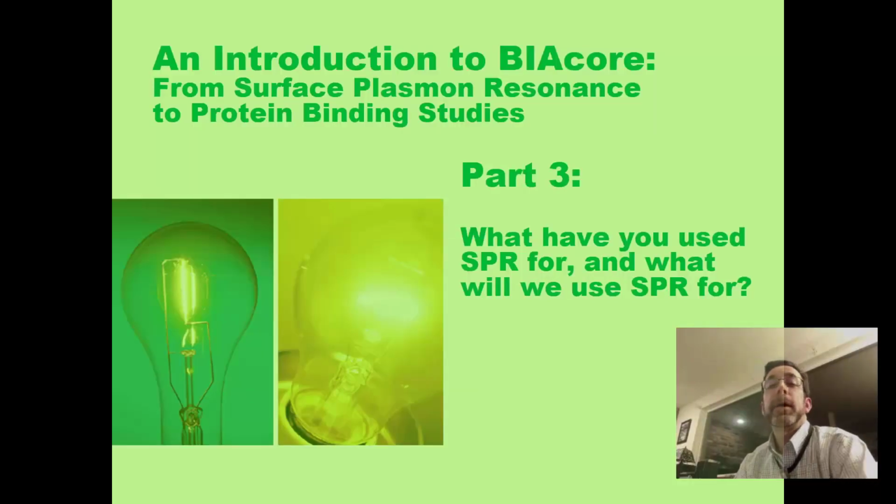All right, now it's time for part 3. What are we actually going to be doing with the SPR? The first thing I want to talk about is I want to show you some data that I collected with my last project, and then I'm going to move on to show you the data you're going to be collecting with this project. This is where we start to talk about the data and what it's going to look like.